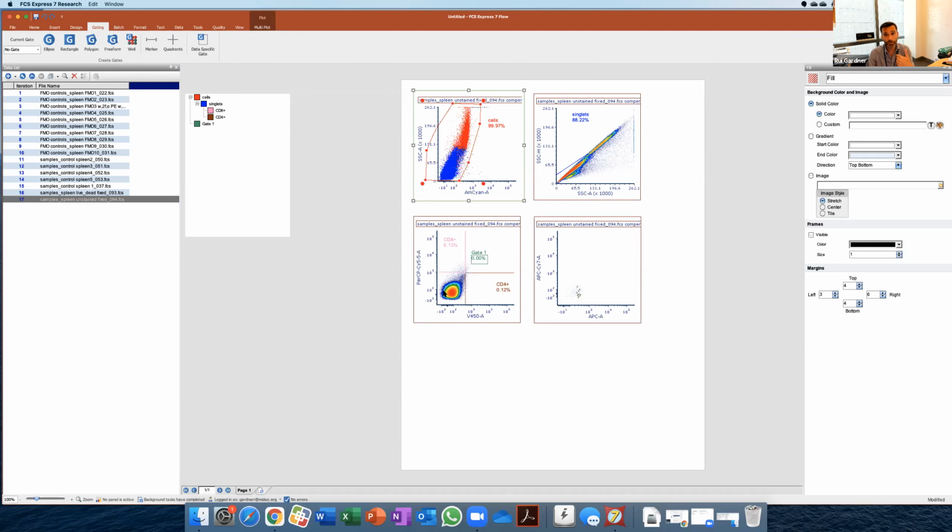And actually, that's a nice thing of analysis that I remember. So this was Marie Hymas from Cytek. She's been a proponent of comparing your unstained with your single stain controls and with your fully stained, right? To see how the spread of the negatives changes. And actually that's done when you're troubleshooting your panel. So if you compare all those things, once you establish your panel, you'll be minimizing these kinds of issues, right?